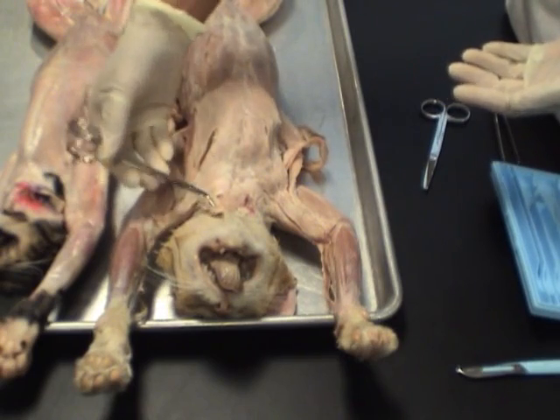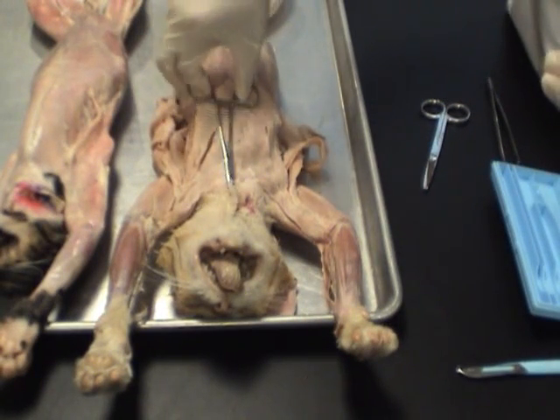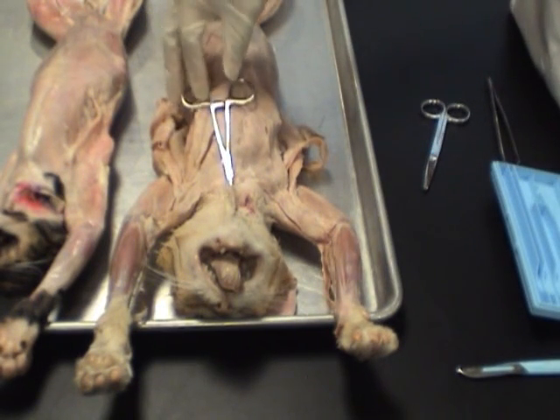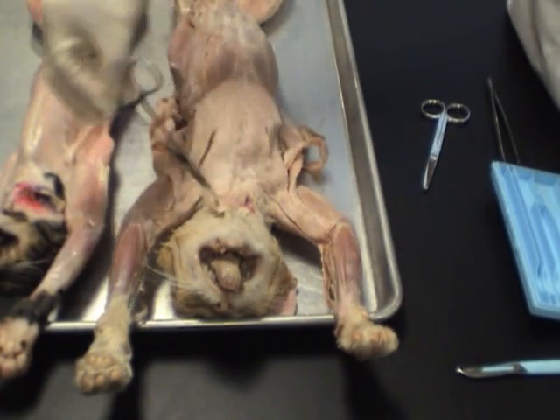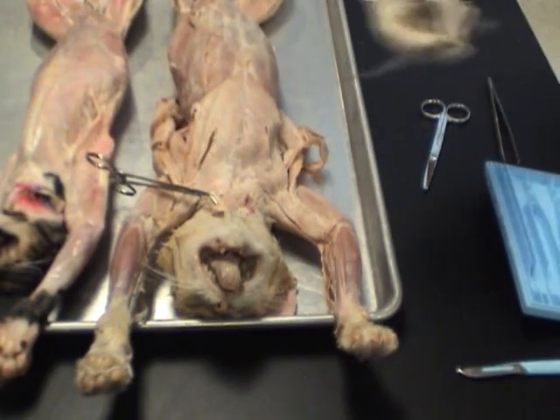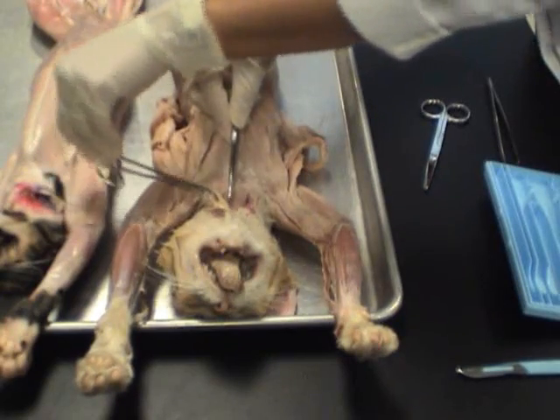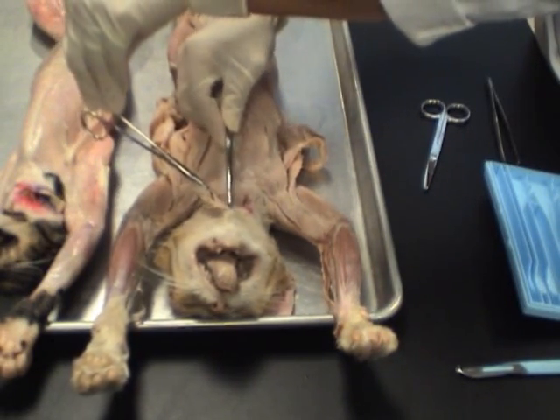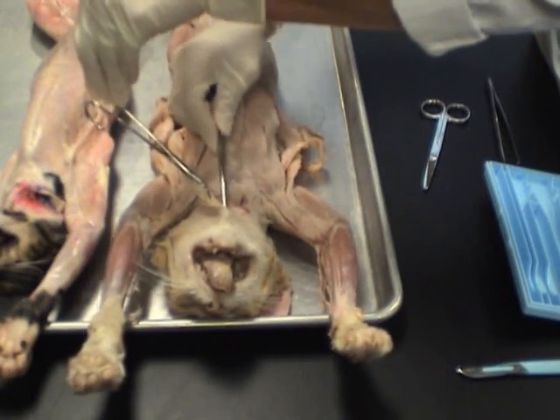Okay, so let's go to the cat now and see what we can do with this. First of all, if we were to begin, let's say we're going to use the hemostat to hold back and see where we're going. I would then possibly use a probe. I will insert the probe underneath the skin, because we're going to try to loosen the skin, loosen the pelt from the muscle underneath.